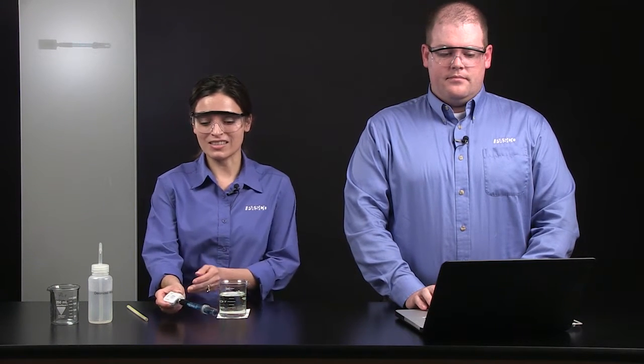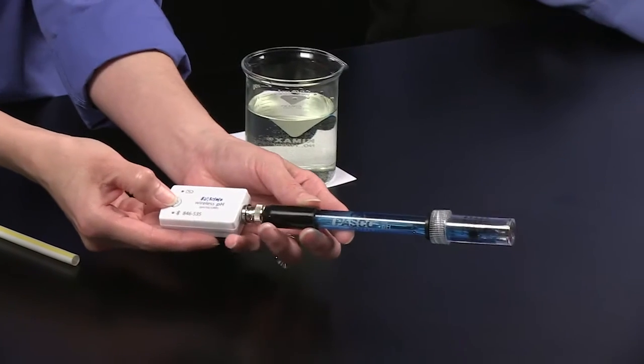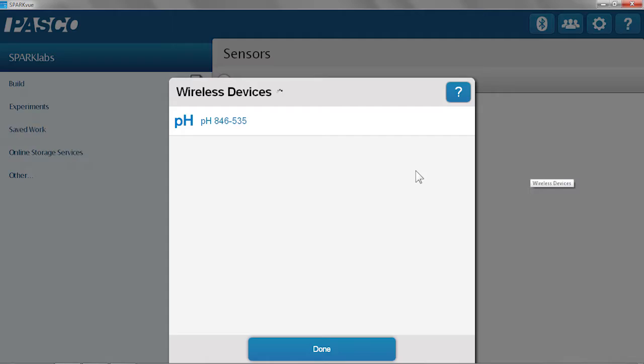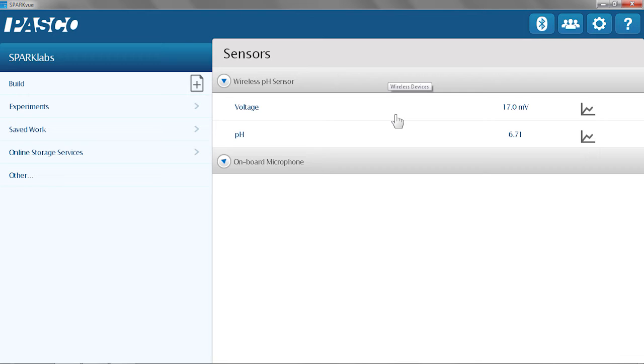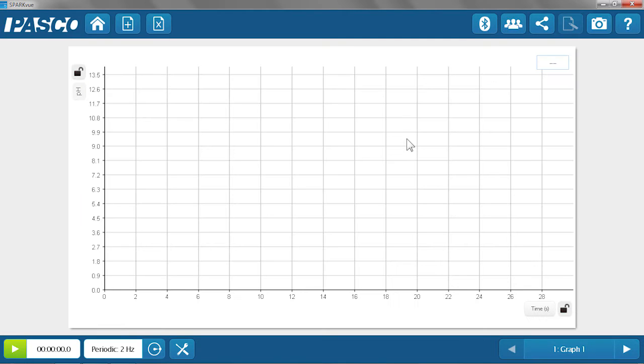First, we're going to connect the sensor. I'm going to turn it on. I'm going to launch the Bluetooth menu to look for wireless devices, and then select the pH sensor from the list. And when it's connected, it flashes green. From the sensors list, we can now select the pH measurement, and it will launch into a graph display.